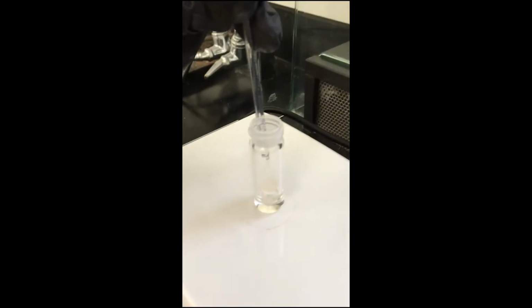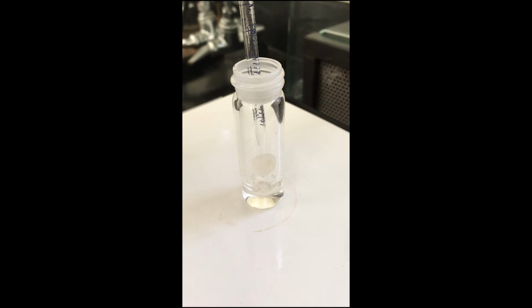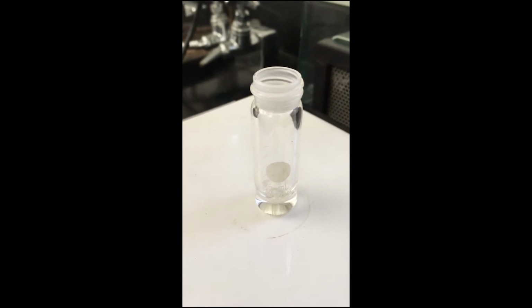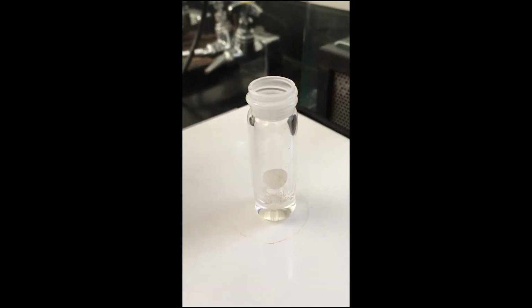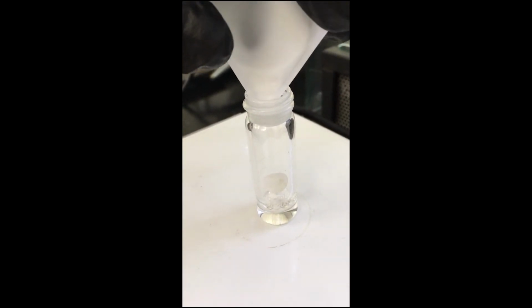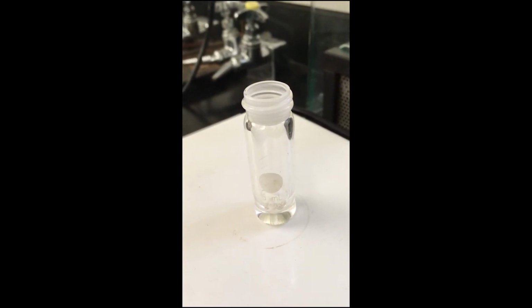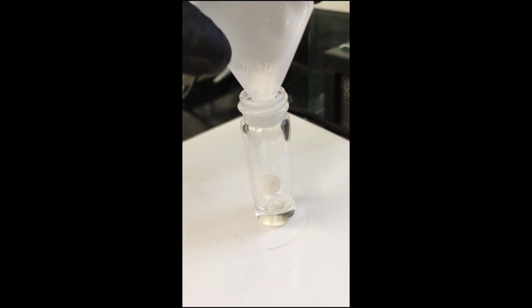All right, so now I'm going to add that 200 microliters of xylene to the reaction flask. And then I'm going to add first the maleic anhydride that we measured out earlier, and also the sulfolene that I measured out earlier.